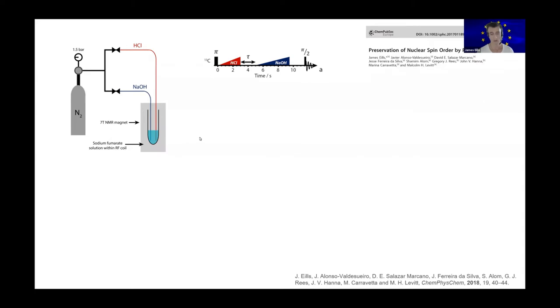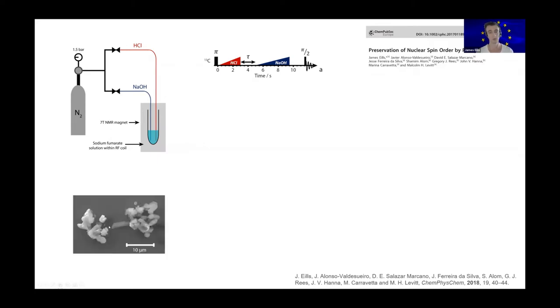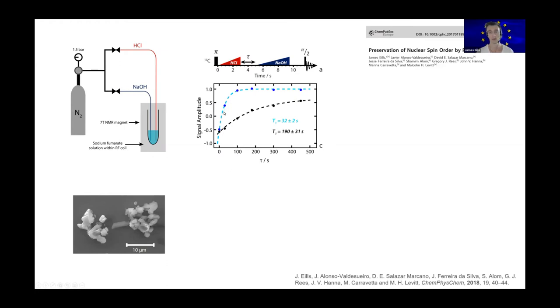So we did that. Here's a little picture of the solid fumarate molecules. And if you do this sort of experiment, it turns out, to my surprise, that it actually worked. The T1 in the solid state is notably longer than in solution state. So that was a cool little demonstration.